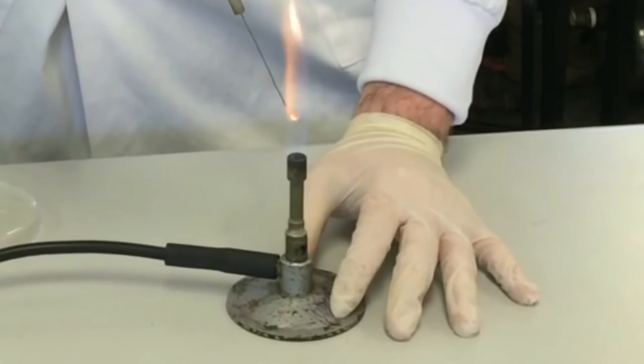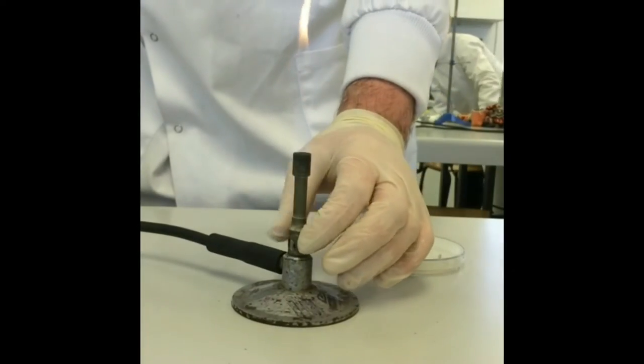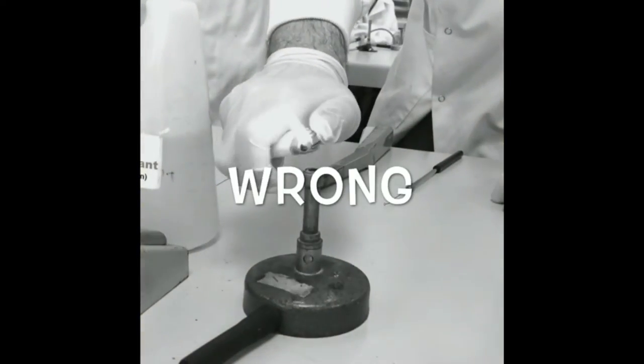When using the Bunsen burner, turn it to a blue flame. When not using it, turn it to an orange flame to make sure it is visible. Use proper equipment for lighting the Bunsen.